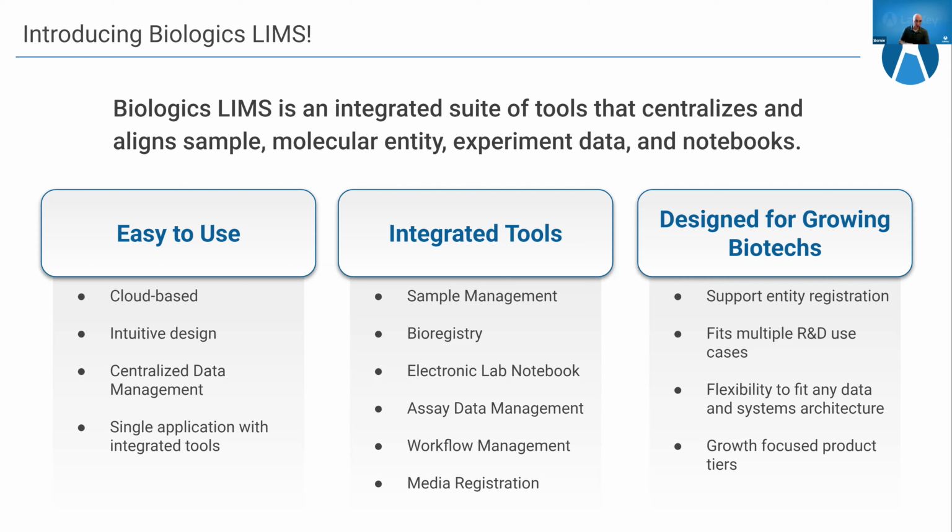Improved focus is really the other benefit. That organizational structure is going to make it so that when you go looking for information, you don't have to sift through all of it, unless you want to, of course, to find what you're looking for. You can filter out work that's part of projects that you don't particularly care about right now.